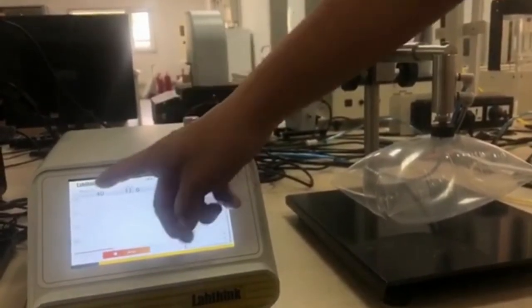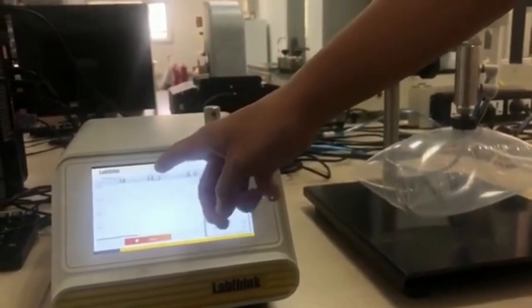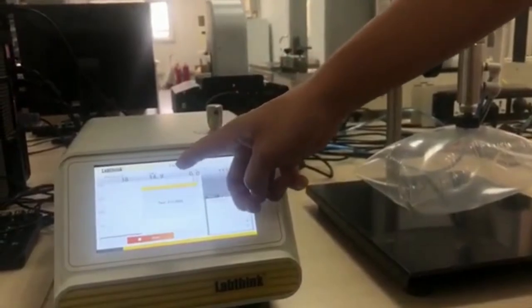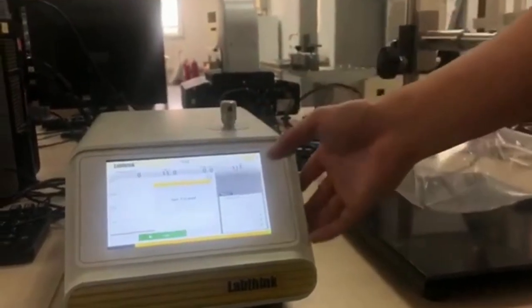When the pressure reaches 70, the time will build up. Now you can see the test finished.